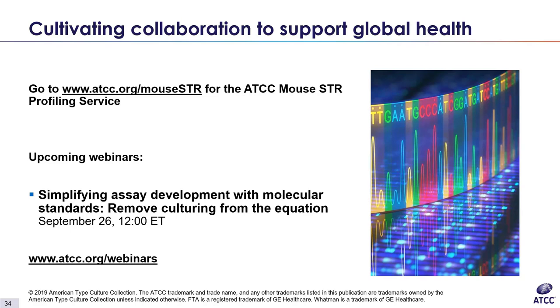Sometimes microvariants are seen where a mutation arises to offset the perfect repeating unit. A good example of this is TH01. TH01's repeat is TCAT. If that last T is mutated to something else, the most common microvariant in humans at the TH01 allele is 9.3. This mutation is going to have 9 repeats plus 3 additional base pairs. And by the way, there cannot be a 9.4, because with repeats of 4 base pairs, a 9.4 equals a 10.